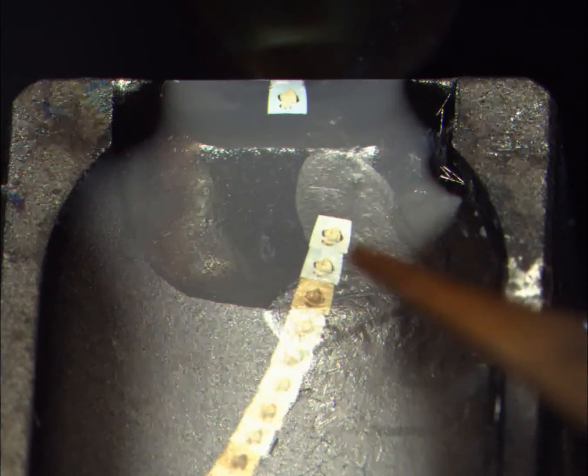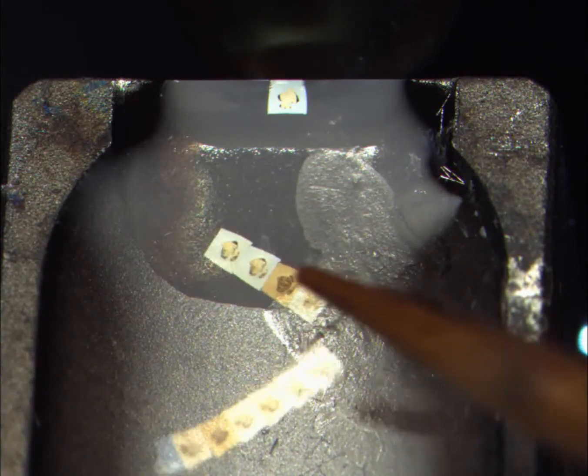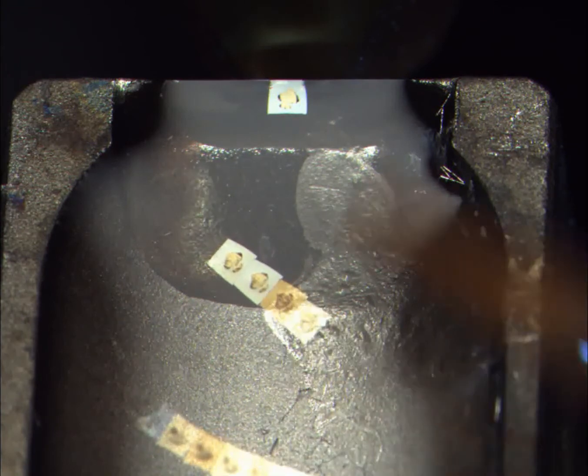To make sure the sections are flat, chloroform vapour is used to soften the resin. The water tension under the sample then stretches the sample out flat.